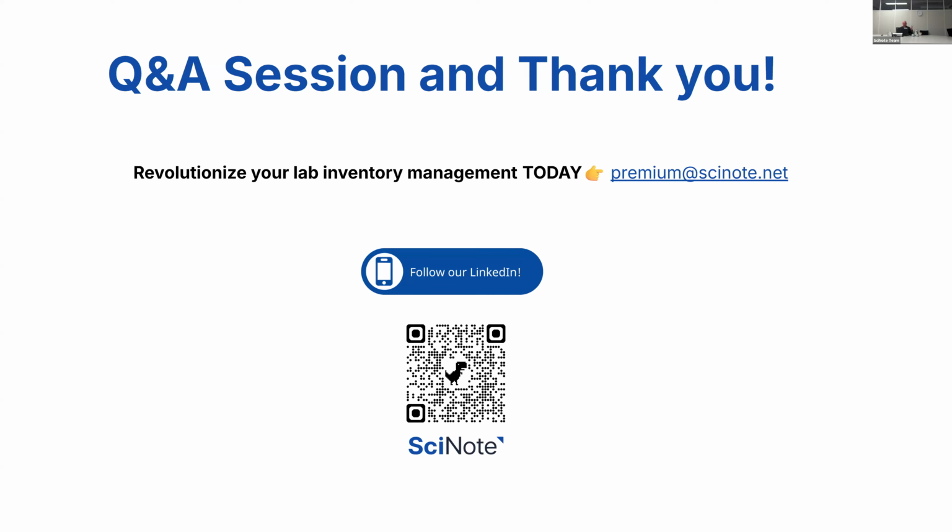Okay, I'm going to move to Sarah's question. How to make it easier for the scientists to record which reagents, materials, equipment is being used. So one thing is you can use the item template. When you're creating a certain SOP under protocol library, you can also have results templates and item templates besides the protocol. So your SOP can already include the items being used. This is one that I think would help a lot. Usually that makes it easier. I think that's the one that I would suggest you try out.